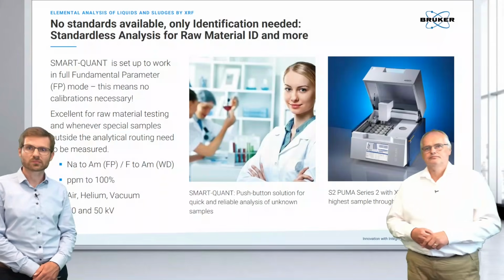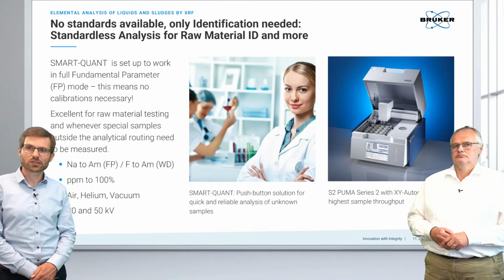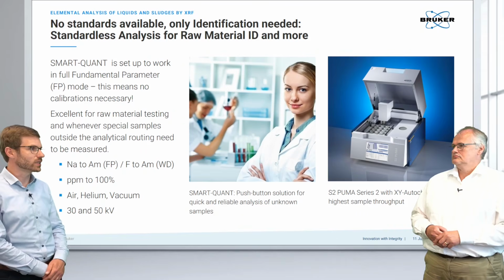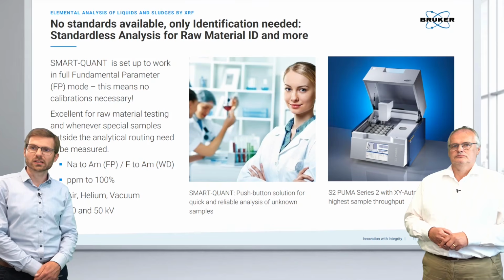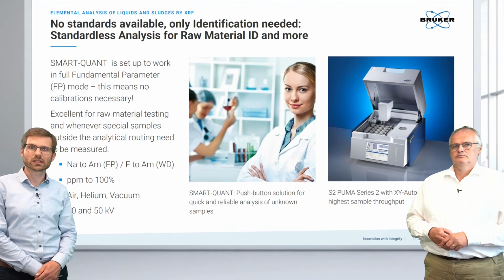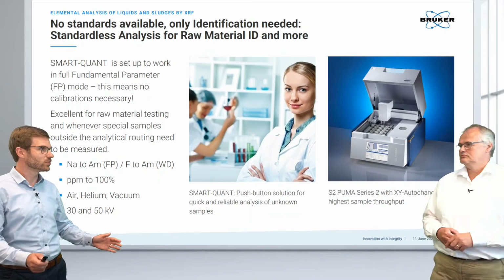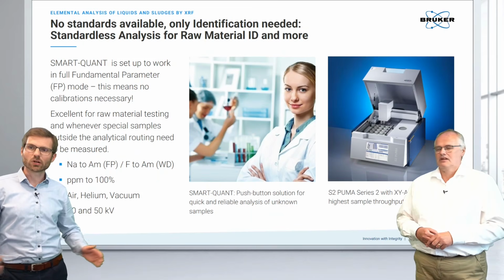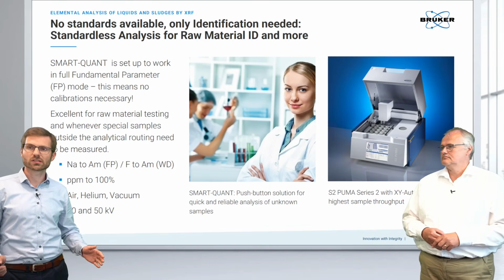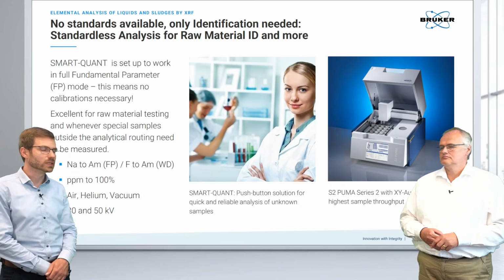Yeah. Now we've shown some examples in process and production control which have used calibrated solutions. So calibrations are always a good solution if you're dealing in a process environment with something that is always quite similar, so you can calibrate easily. You're looking maybe at some smaller variations of concentrations. You create some secondary references and you're good to go.